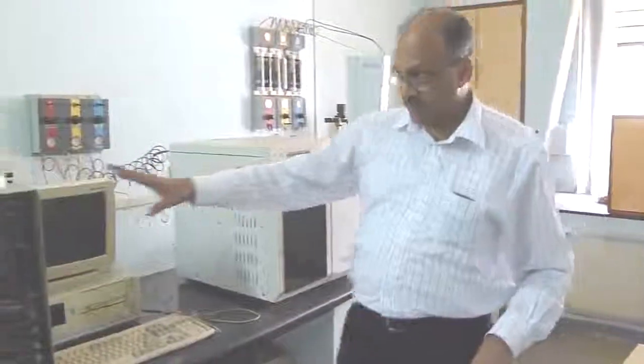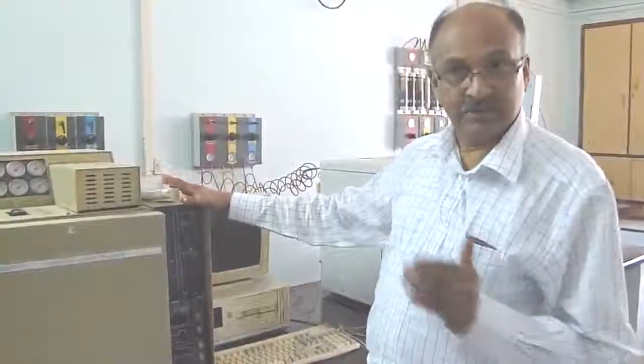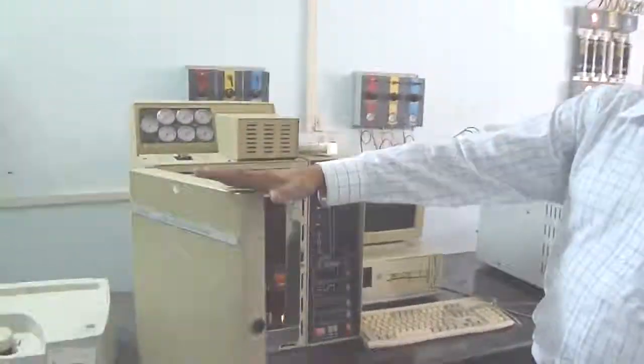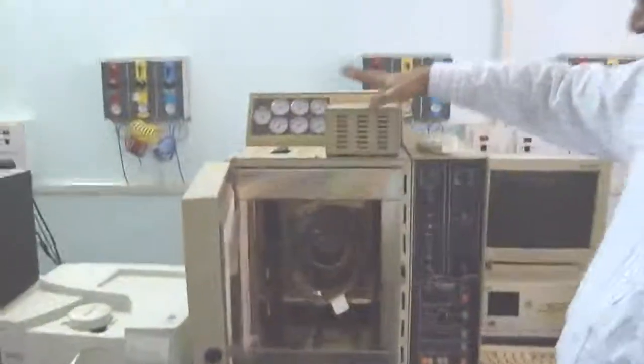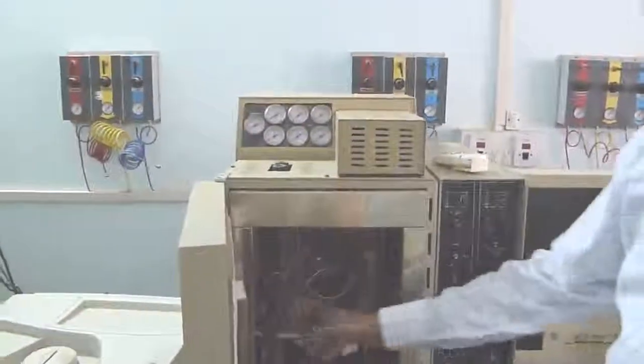The purpose of these gas chromatographs is to analyze gases, analyze pesticide residues, and other residues of interest. Basically, a gas chromatograph consists of an instrument where the heart of this instrument is the column.